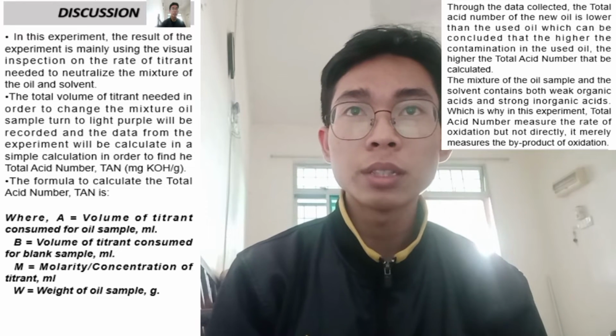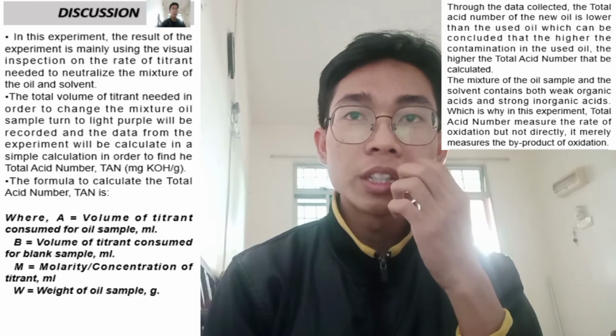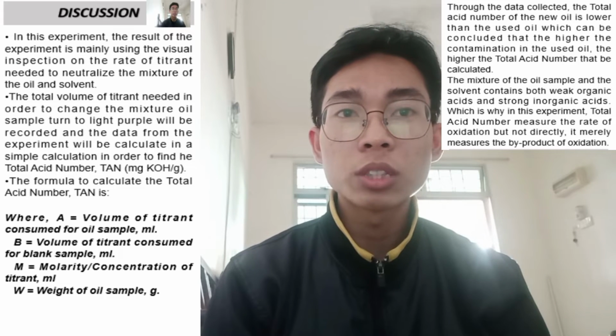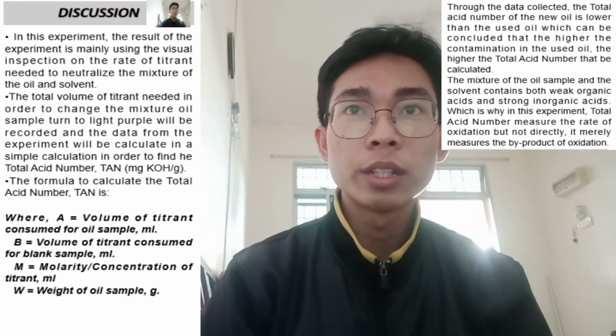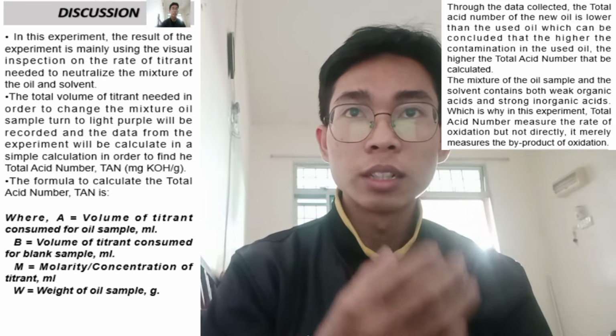Okay, this experiment mainly uses visual inspection, according to the neutralization of the mixture of the oil and solvent and the volume of titrant needed to change the color.